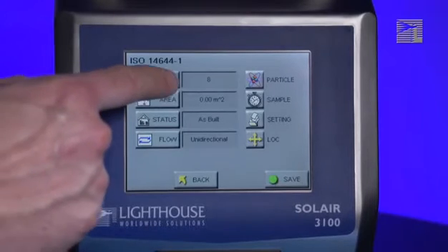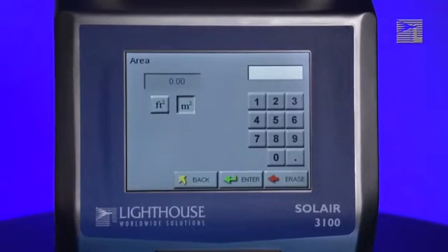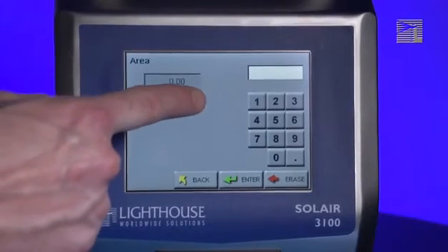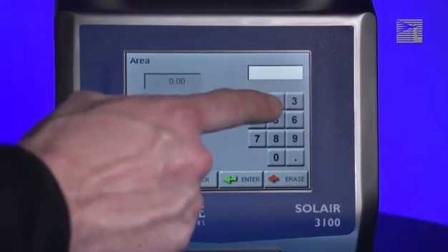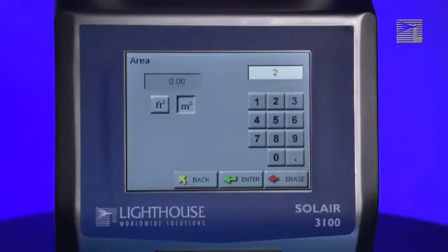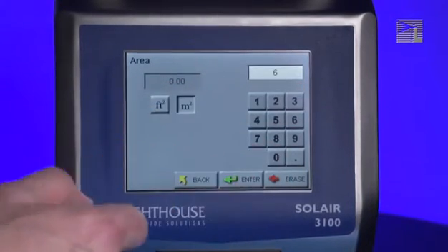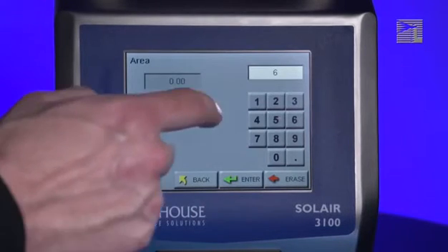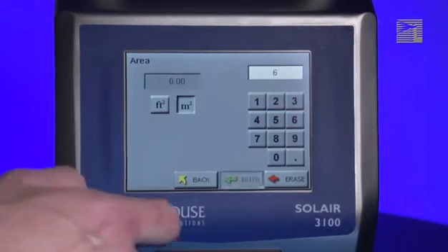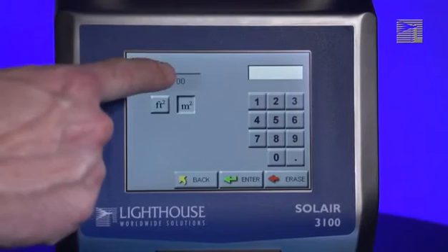Press the Area button to set the area. First, select the units to enter the room area in, either square feet or square meters. Next, use the keypad on the right side of the screen to enter the area of the room. If you make a mistake, press the Erase button to erase the last character entered and re-enter the value. The new value will display in the right corner above the on-screen keypad. When you are finished, press the Enter button. The new value will display in the top left corner.